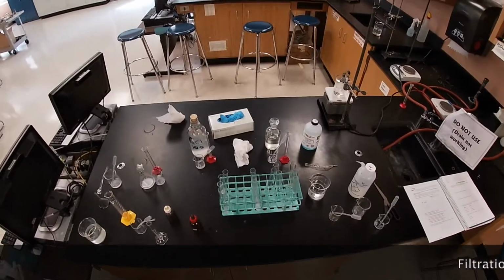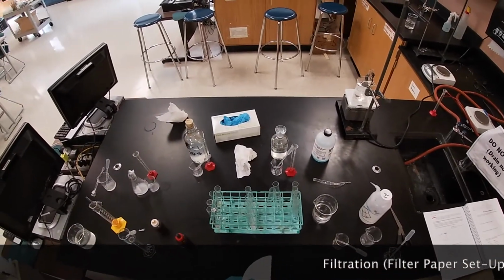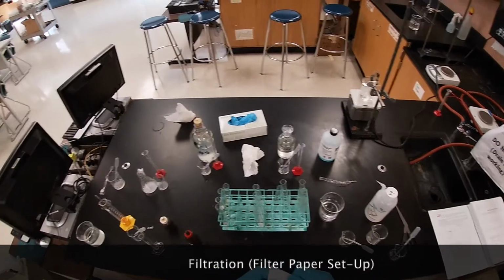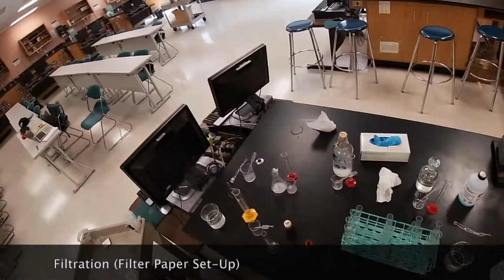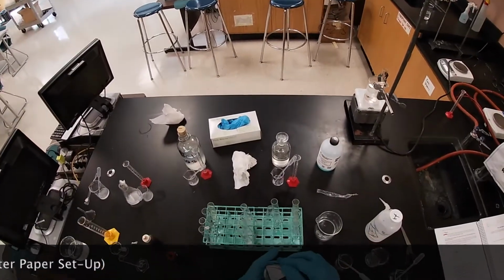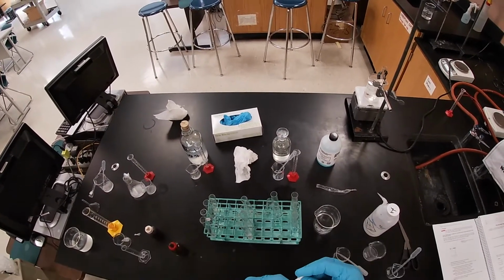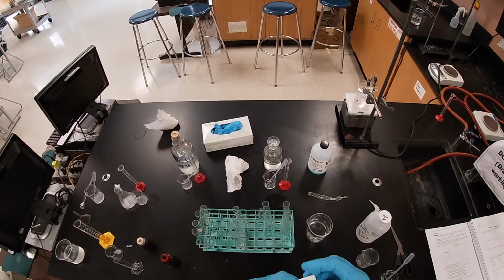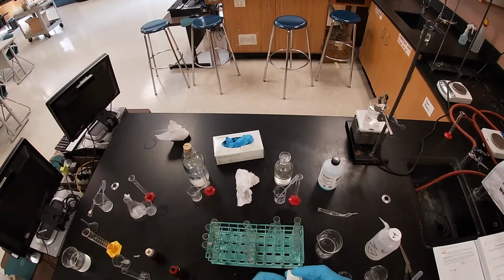The next thing we're going to do is fold our filter paper so that we can go ahead and do part C. We have to fold our filter paper in half and then half again. And I'm going to suggest another half. Why? Because our funnel is a little bit smaller on the small side. So we might even be able to do another half. Okay, and then the next thing we're going to do is set down our filter, add a little bit of water so that we can adhere the filter paper to our funnel.